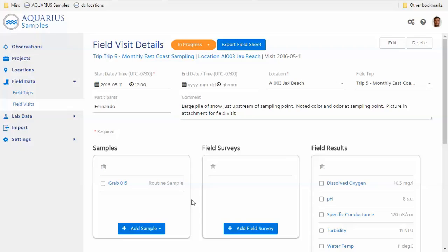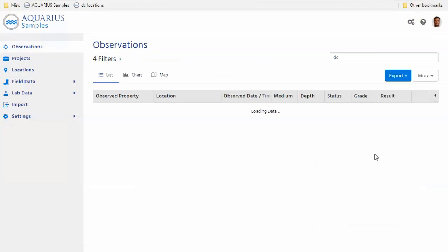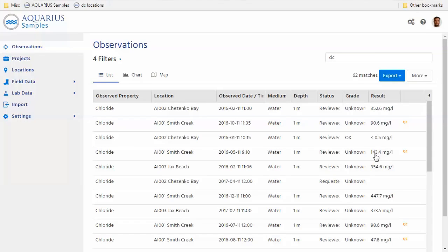And of course, this is a simple example, but it really is a good explanation of how the data can unfold and really start telling a story as you drill into the related metadata from individual data points, and how the system's going to help you make that easy. So the key point here, I think, is that you really don't have to spend too much time to get all this information. You don't have to search around different systems and so on. It's all right there.